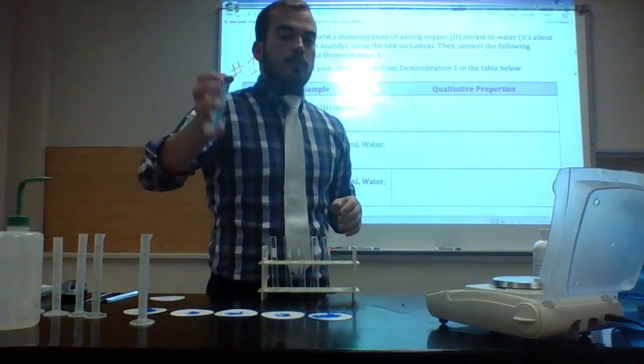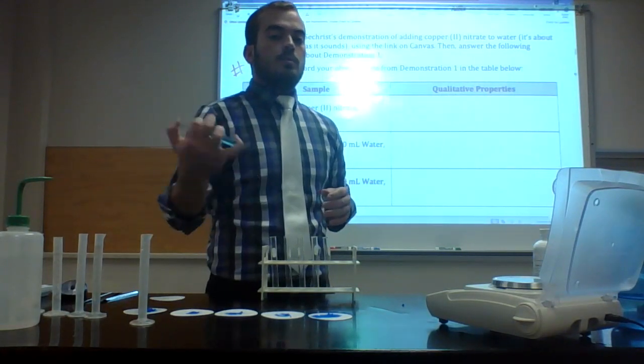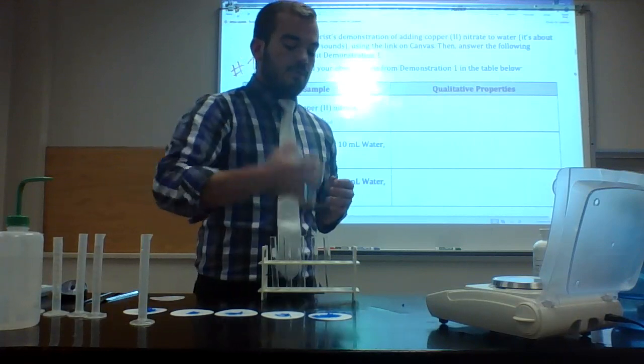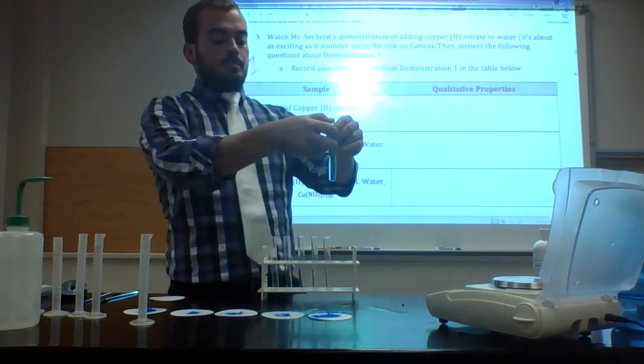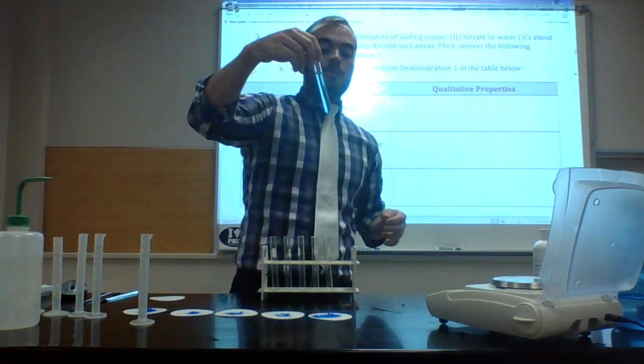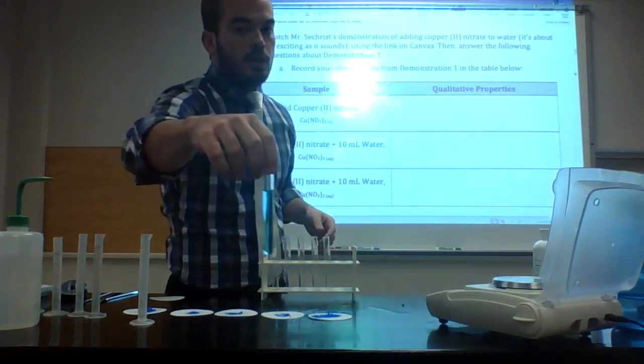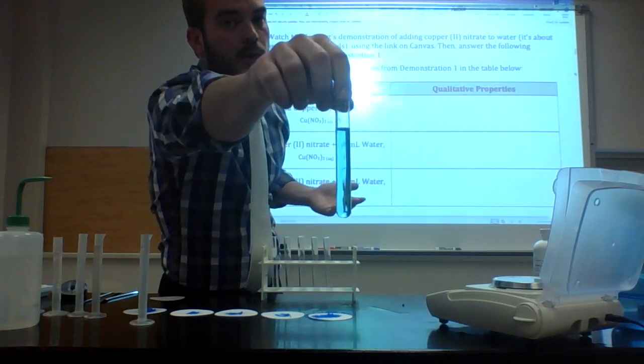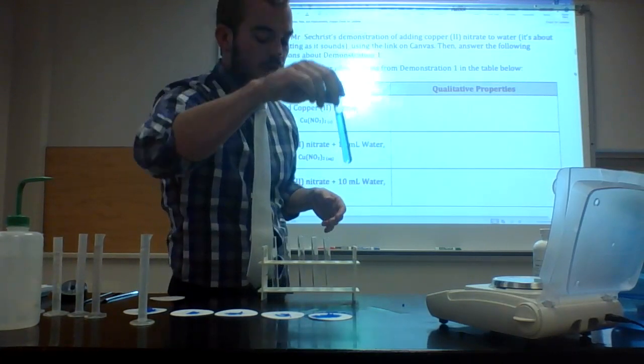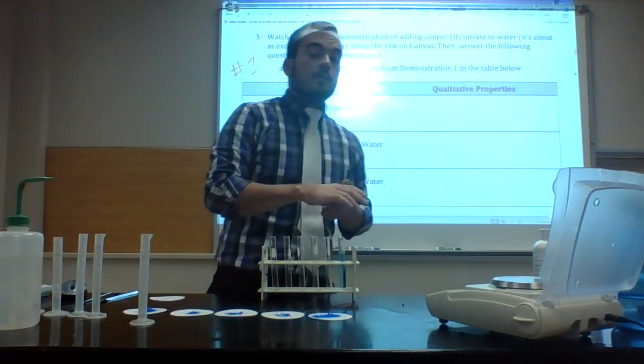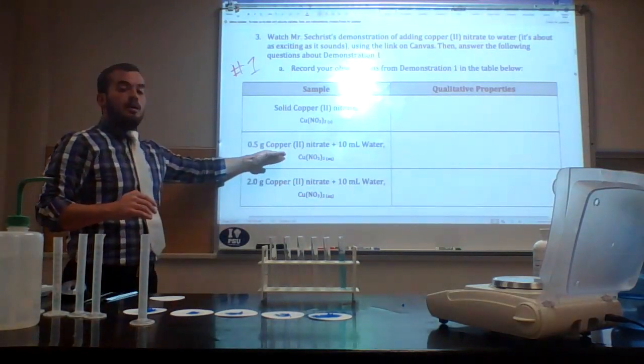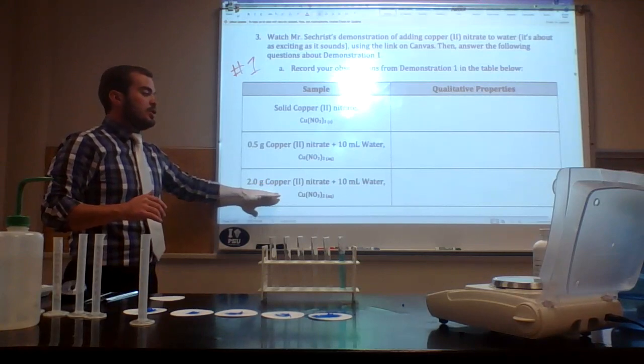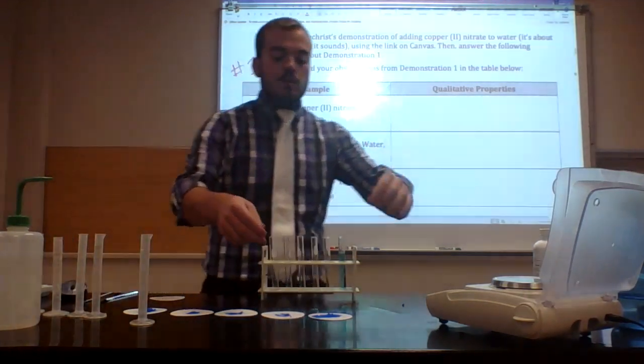You really shouldn't just put your thumb over the test tube like this, it's bad practice, but I'm just trying to make it a little bit faster for everyone. Most of the copper is dissolved already and the rest will shortly. As you can see it makes a nice light blue solution, and that's why we picked copper(II) nitrate, it's just such a nice color. So that is 0.5 grams of the solid with 10 milliliters of water.